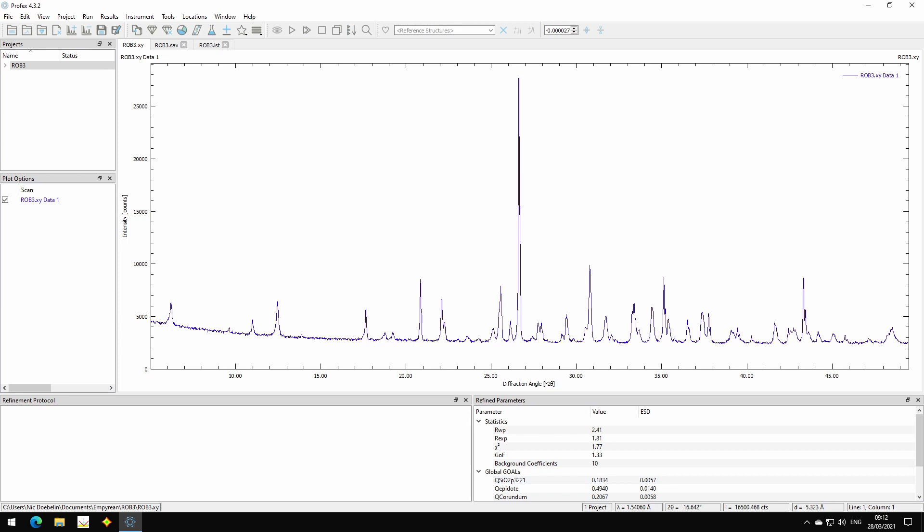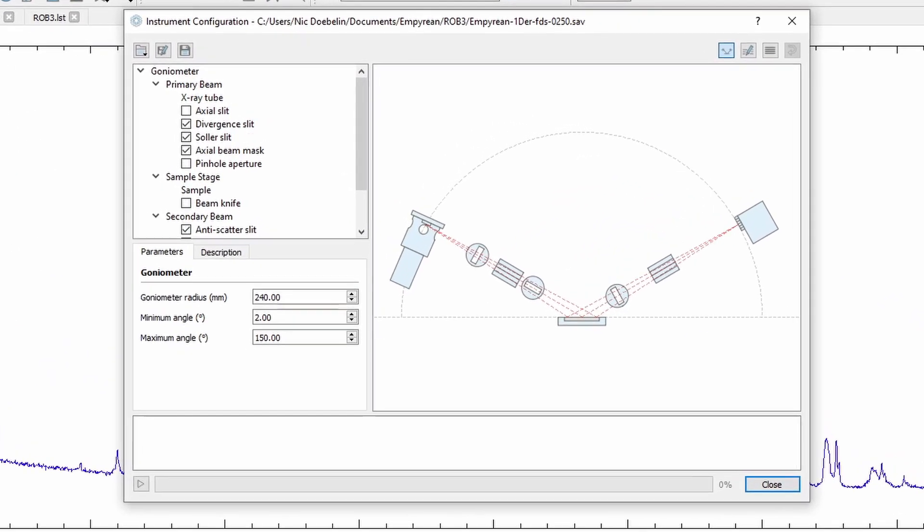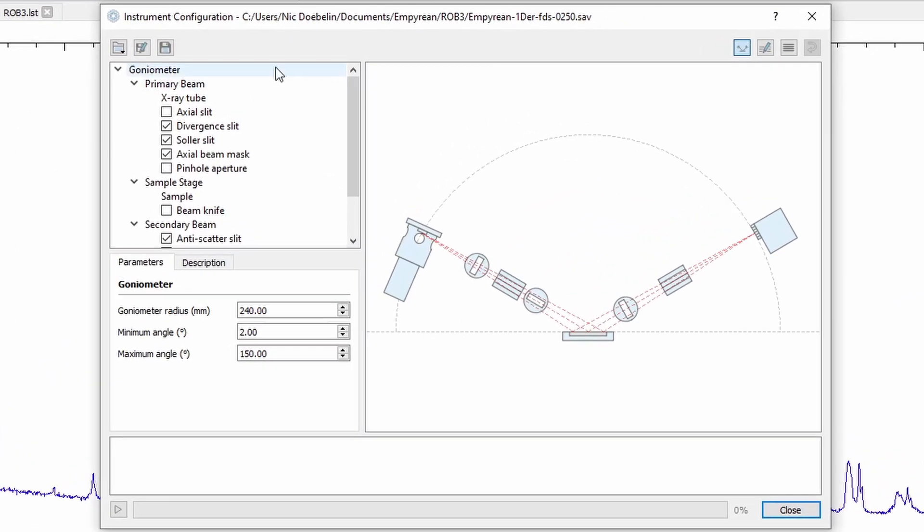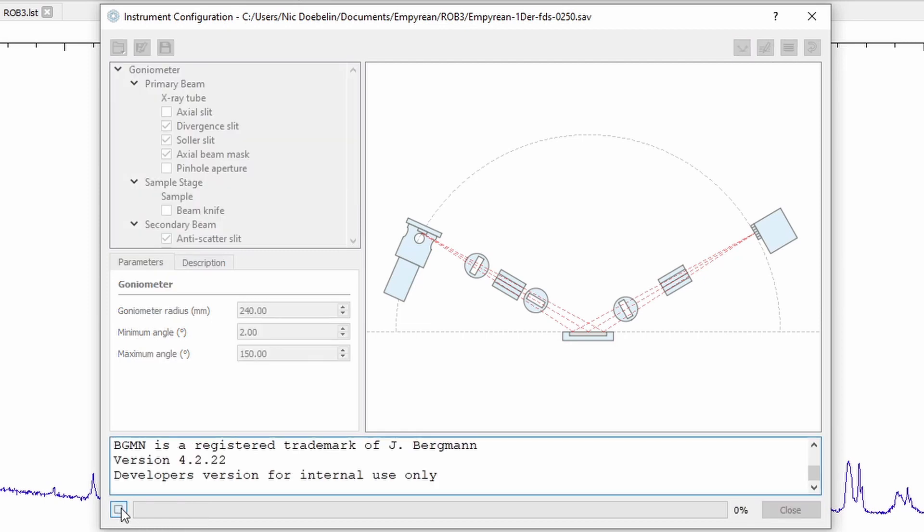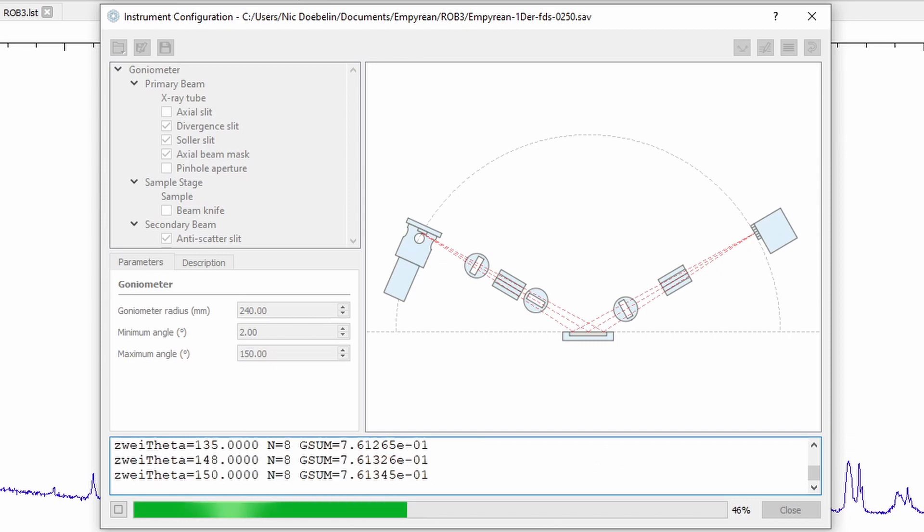And the last new feature I want to show is related to instrument configurations. If we modify our current instrument configuration and then start the computation of the profile, this process is now multithreaded. So it's using all CPU cores and it's a lot faster than in previous version where only one CPU core was used.